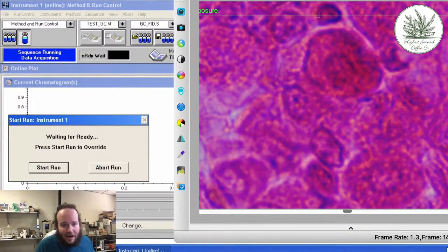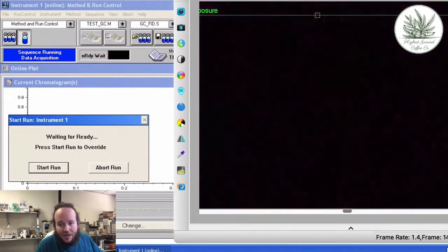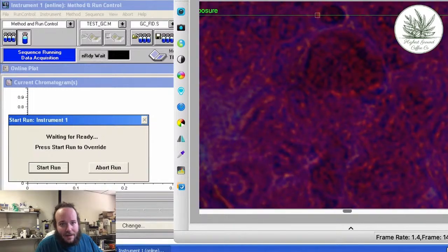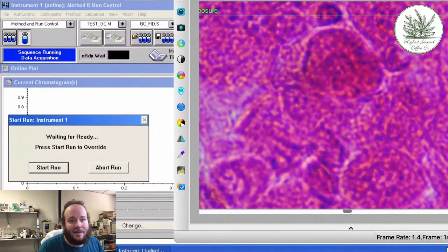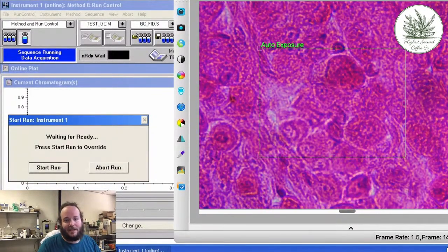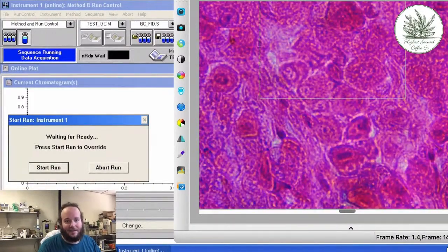And apparently we can see some of these really neat cells. Just going to up the contrast a little bit. Doesn't really do what I wanted. That's still really stinking cool. All right, I mean, how cool is it? You can make out the cellular structures, the outlines, and you can even see some of the mitochondria, I think is what that is, inside of there. Like, how neat is that?